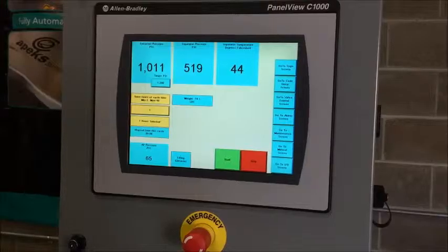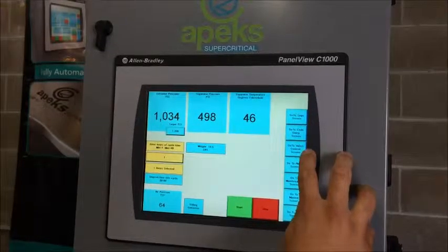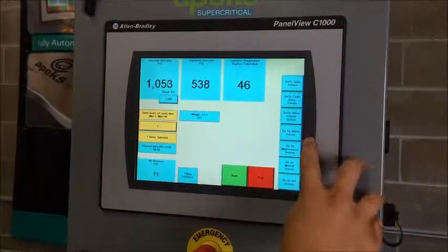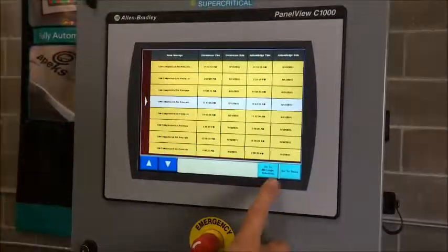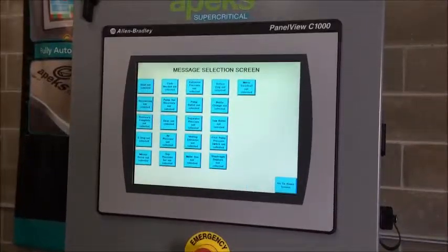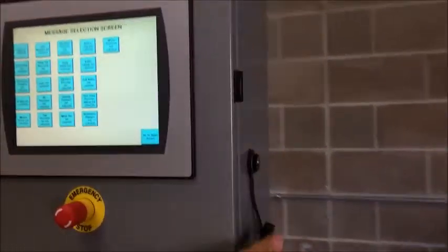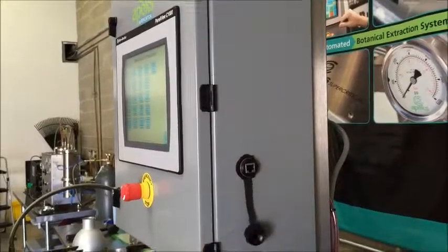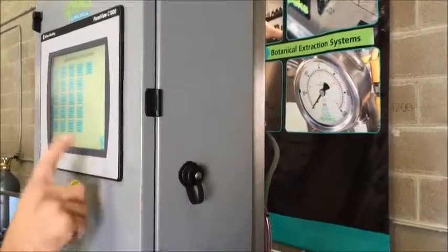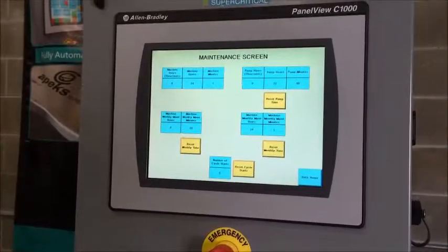Let me show you these screens real quick. We have a logo screen — if you ever just want to keep your extraction parameters private, you'll come here and it just shows a logo screen. There's a code entry screen: if you finance a machine, you have to enter a code each month to keep the machine running. We have a valve control screen used for debugging and troubleshooting, and an alarm screen to track anything that has happened on the machine. We also have a message select screen — these are all the text messages or emails you can have sent to your phone, so you can track the entire run via email or your phone, or get notified if there's an issue. That's what the Ethernet cable on the side of the machine is for — you plug straight into the internet. This also gives us the ability to send you software updates free of charge as long as you're plugged in.